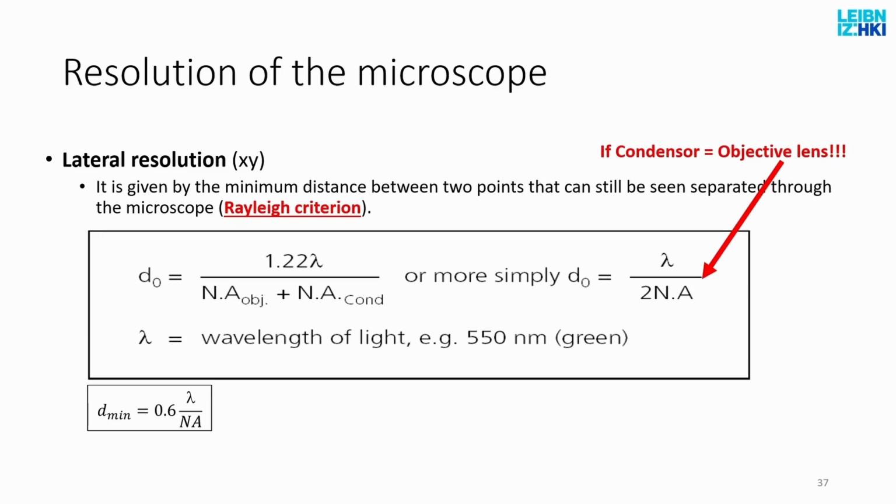Unfortunately, the most typical nuclear signals come from DAPI and Hoechst, which are blue. So oftentimes it's exactly the opposite. This is what it is. Or you just avoid measuring the nuclei. But this has to be kept in mind when you design your experiments. Realistically, whichever visible light you use, you're not going to get better than 200 nanometers.